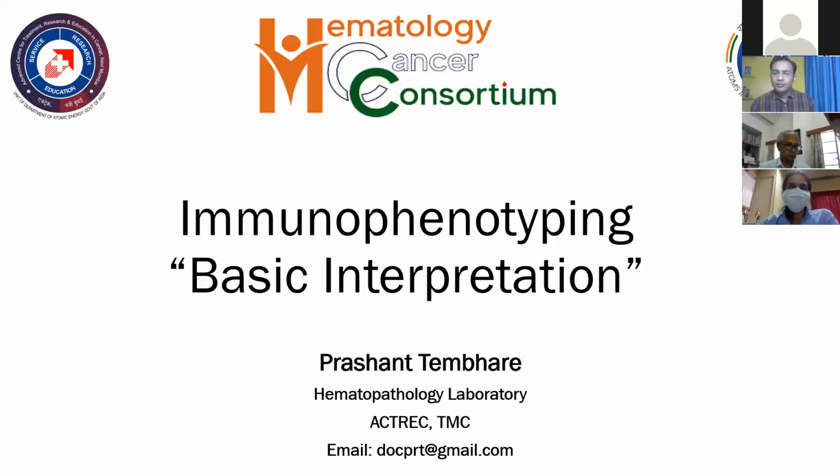Second webinar of Hematology Cancer Consortium. The first one we did was on morphology, interpretation of morphology for clinicians. The second one is focusing on immunophenotyping and its basic interpretation for all the clinicians.